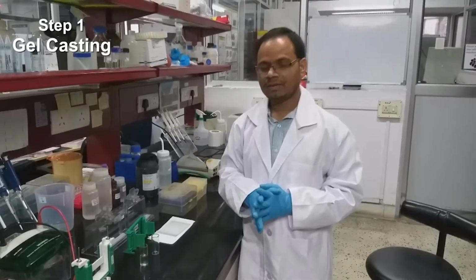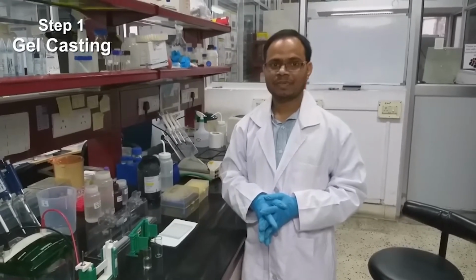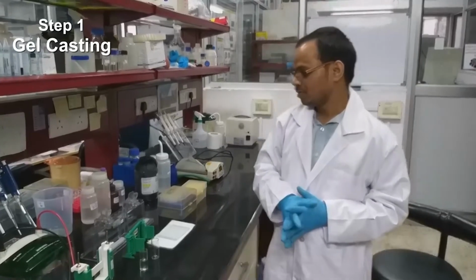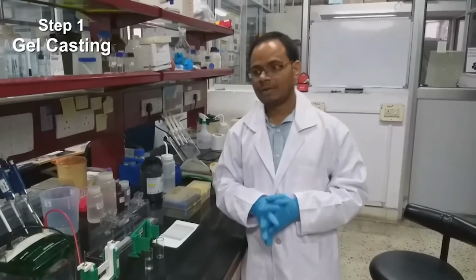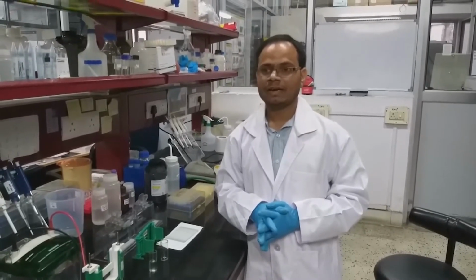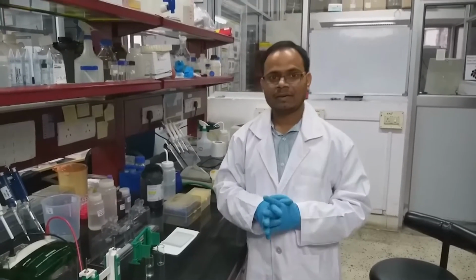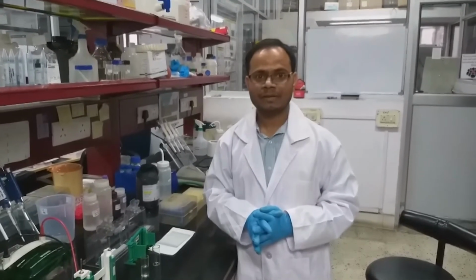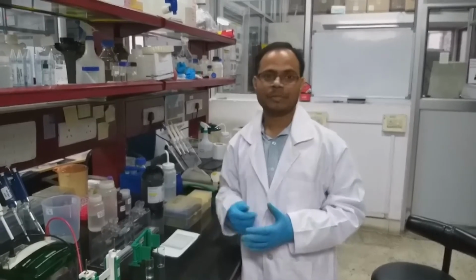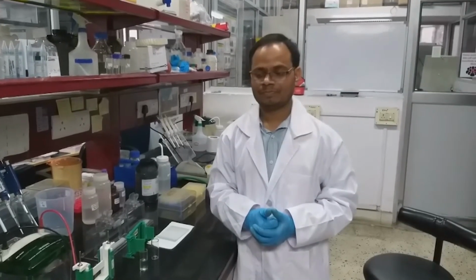In addition to that, we also need 10% SDS prepared in double distilled water, 10% ammonium persulfate, and TEMED. The role of ammonium persulfate and TEMED we can see during preparation of the gel. They act as catalysts.